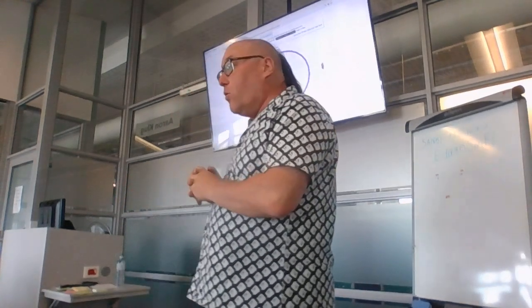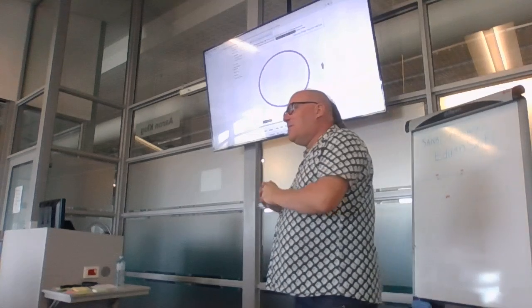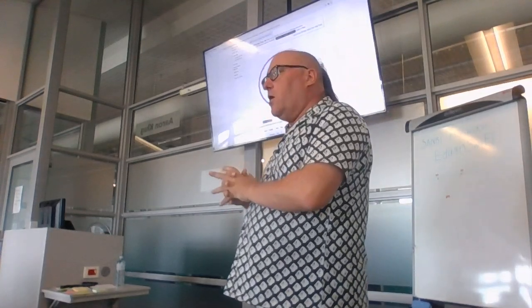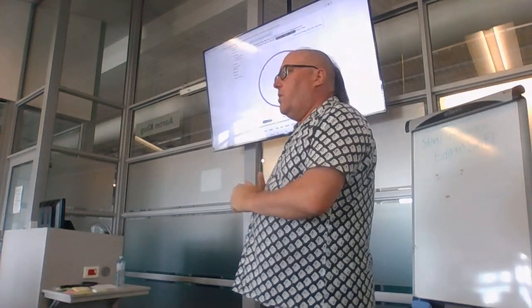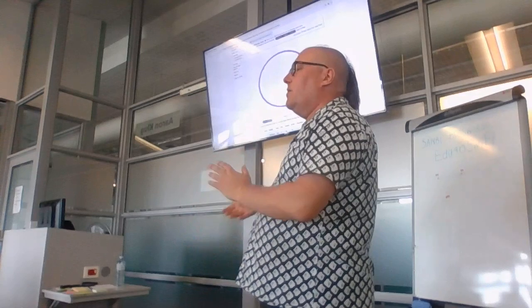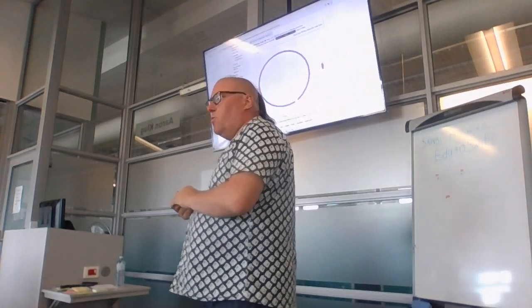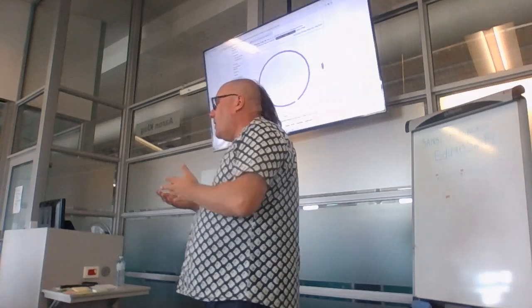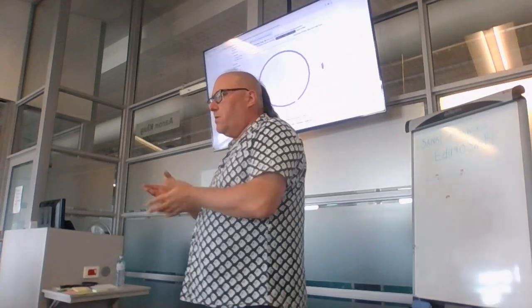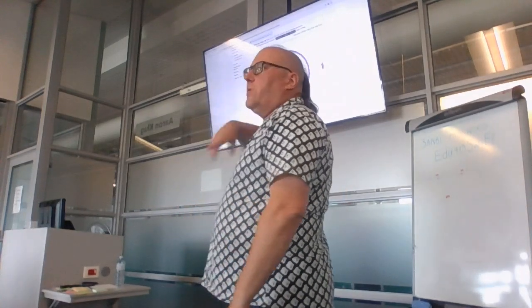There's a guy called Ryan Wick, no relative of John Wick as far as I know, who is in Australia, and he does a lot of evaluation of assembling from nanopore data. He's basically updating his results every few months or whenever the new data is coming out. Like now we've got the R10 flow cells, Kit 14 chemistry, and all of those kind of things. And he's redoing this stuff.